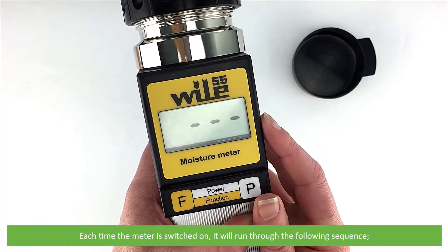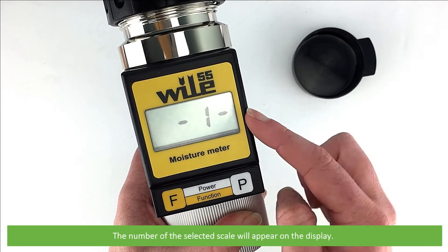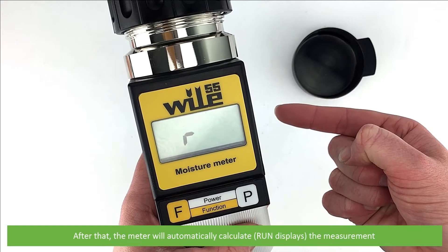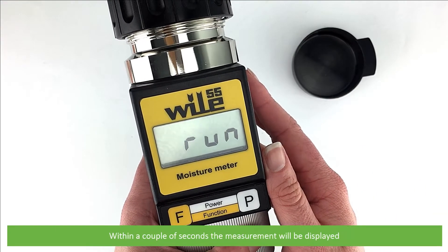Each time the meter is switched on it will run through the following sequence. The number of the selected scale will appear on the display, after that the meter will automatically calculate the measurement and within a couple of seconds the measurement will be displayed.